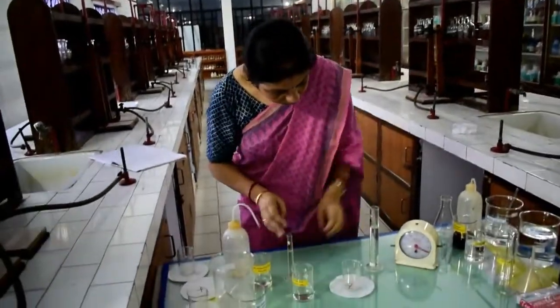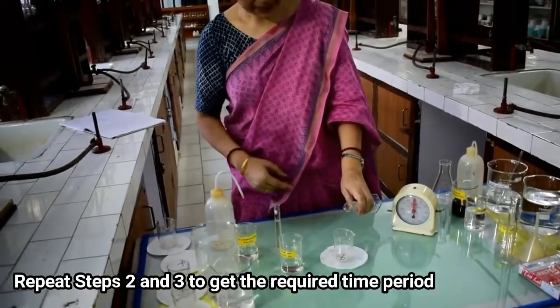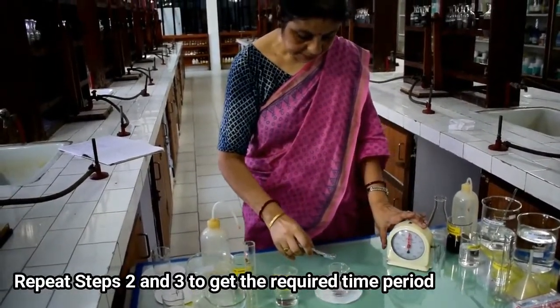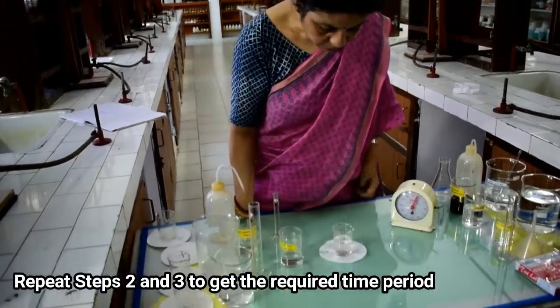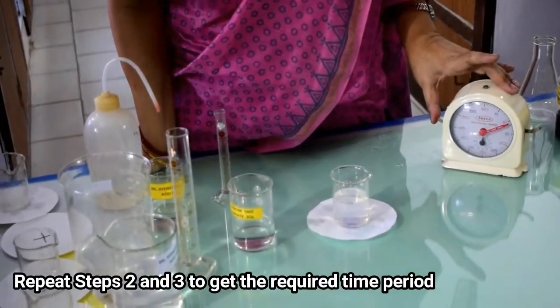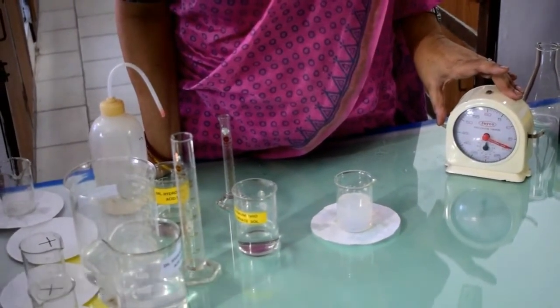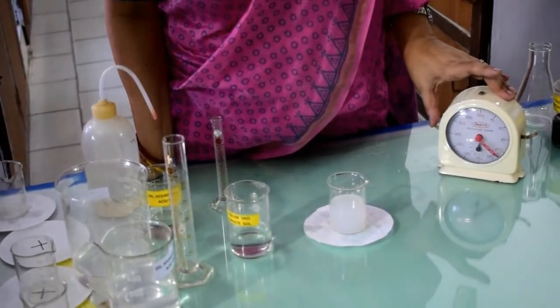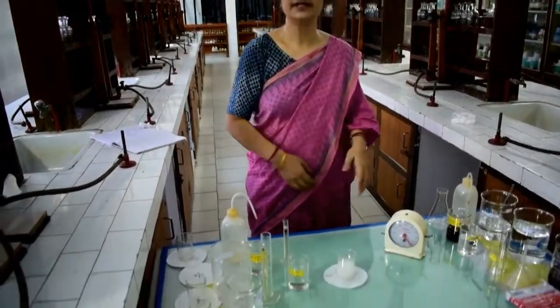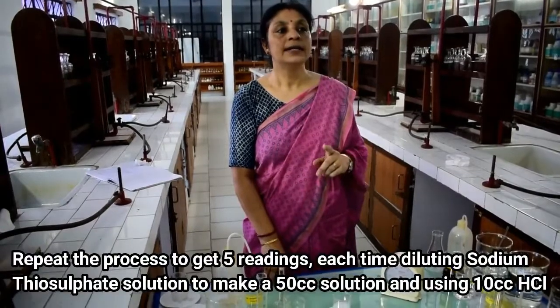Now again, it is the 0 mark. Now I add this 40 cc of sodium thiosulfate and 10 cc of water, and I add HCl, and the stop clock starts. Again I start viewing from the top, and I will carry on till the cross mark vanishes. And here it is. So in the second reading, we saw that it took 25 seconds for the colloidal sulfur to be formed when 40 cc of sodium thiosulfate and 10 cc of water was taken.